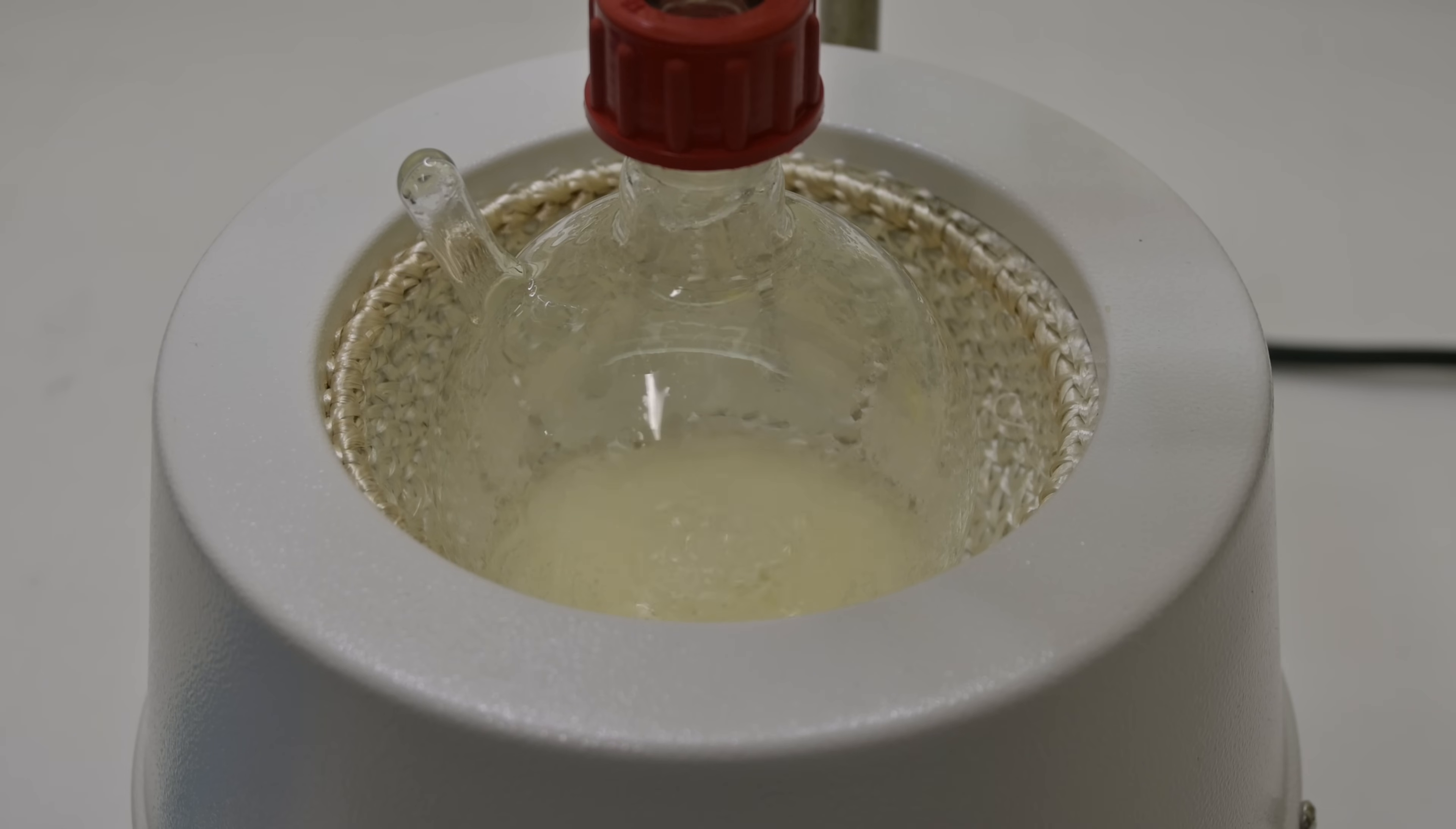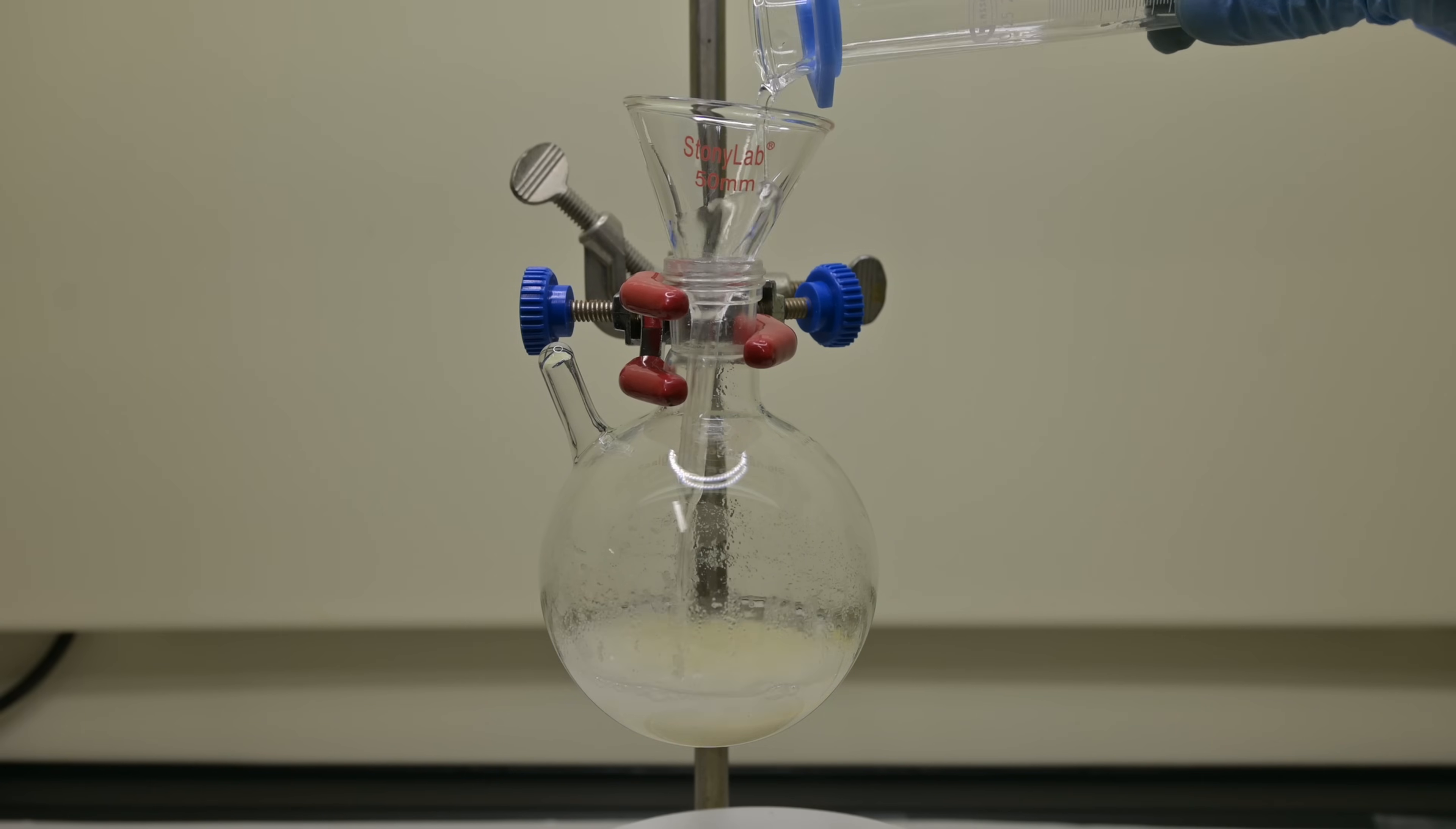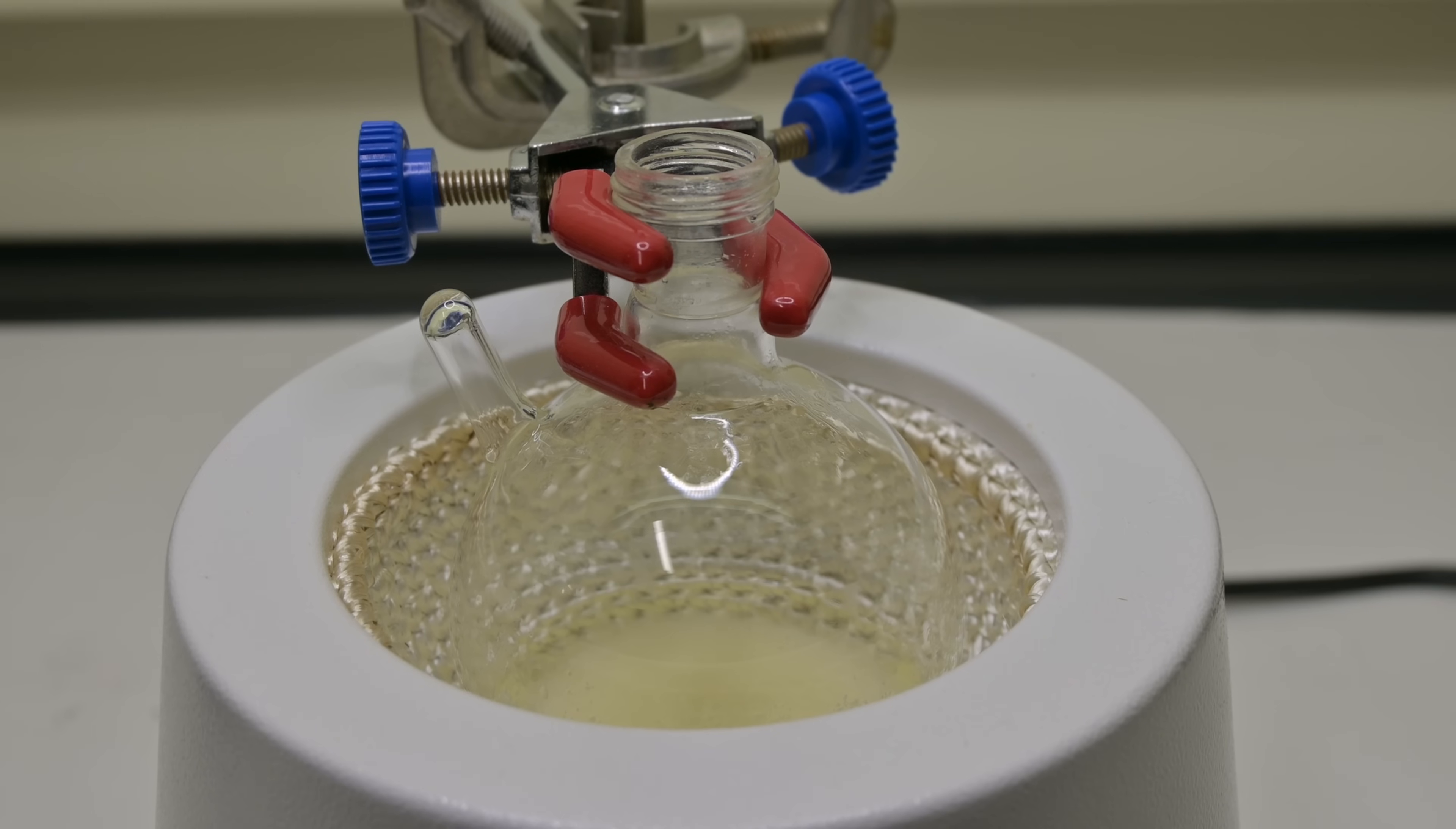Throughout this step, I keep an eye on the condenser to make sure everything is cycling properly and there's no leakage. After hydrolysis is complete, I turn off the heat and allow the mixture to cool slightly. Then I dilute the reaction by adding 15 mL of cold water. This helps bring the solution to a manageable concentration and also cools it down in preparation for the next step. I stir the mixture to ensure it's well and evenly mixed.